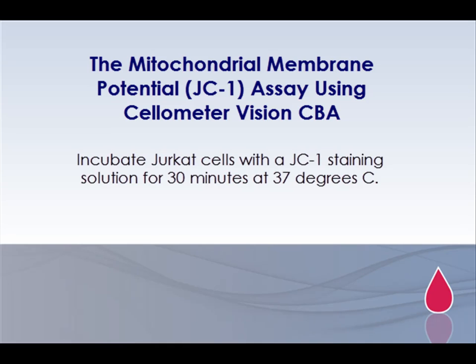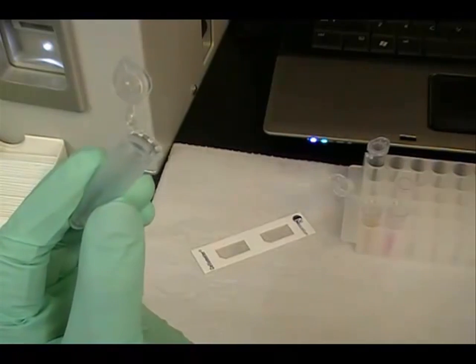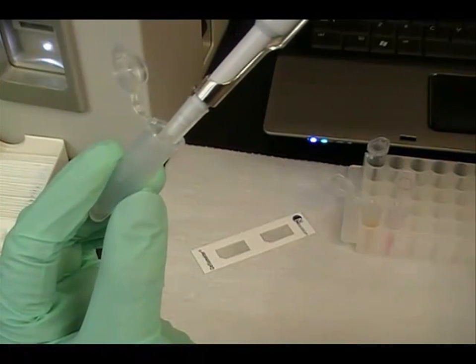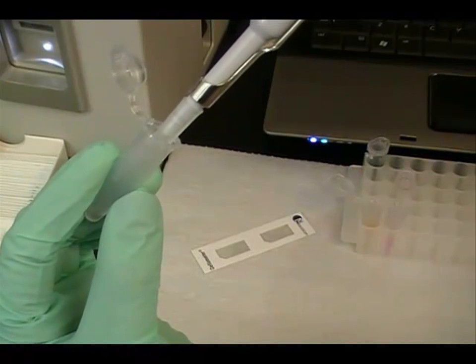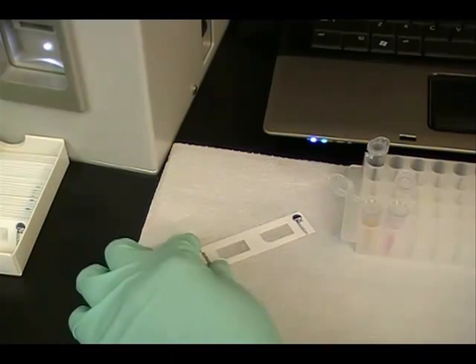To run this experiment, Jurkat cells were incubated with a JC-1 staining solution for 30 minutes at 37 degrees Celsius. Following incubation, 20 microliters of sample was pipetted into the Cellometer counting chamber. The chamber was inserted into the Vision CBA instrument.